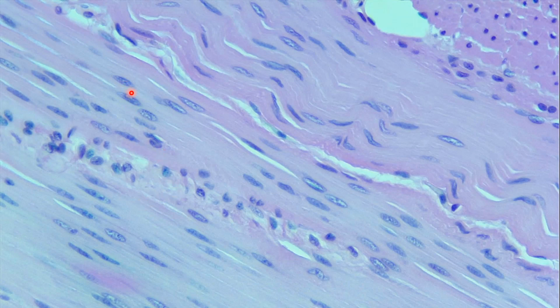For me, it's very large nuclei. The dense regular connective tissue had small purple dots, and those were those fibroblasts, but this has very large, big purple ovals indicating those nuclei. And we see that in smooth muscle, okay?